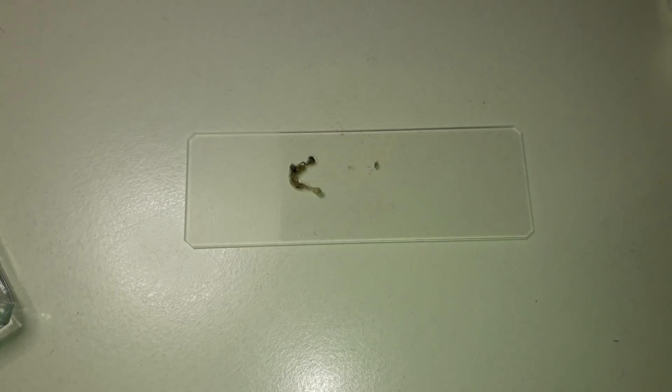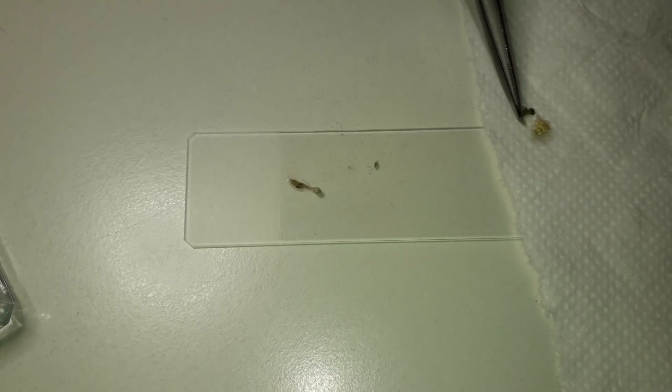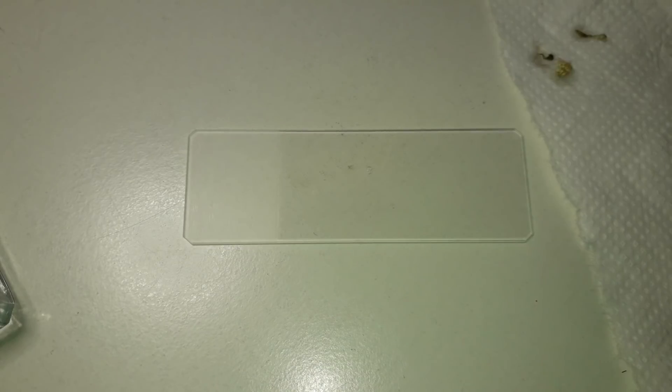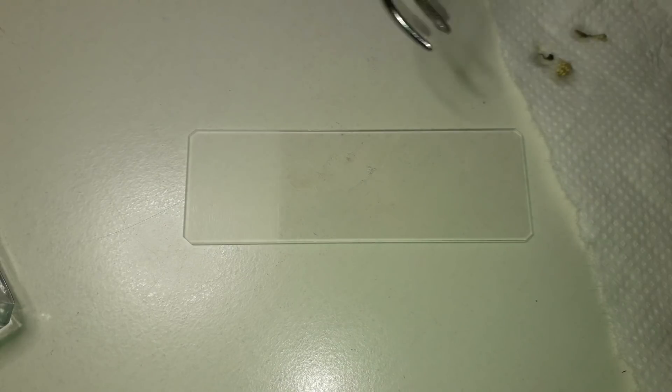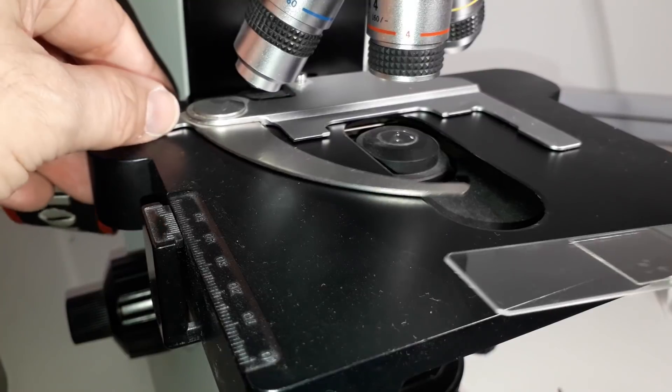The mycelium and hyphae of the fungus are a little bit difficult to see, but I simply remove the broccoli and in the water drop there is now the fungus. I add another water drop so that I can put a cover glass on top without any problems, and then everything goes directly under the microscope.